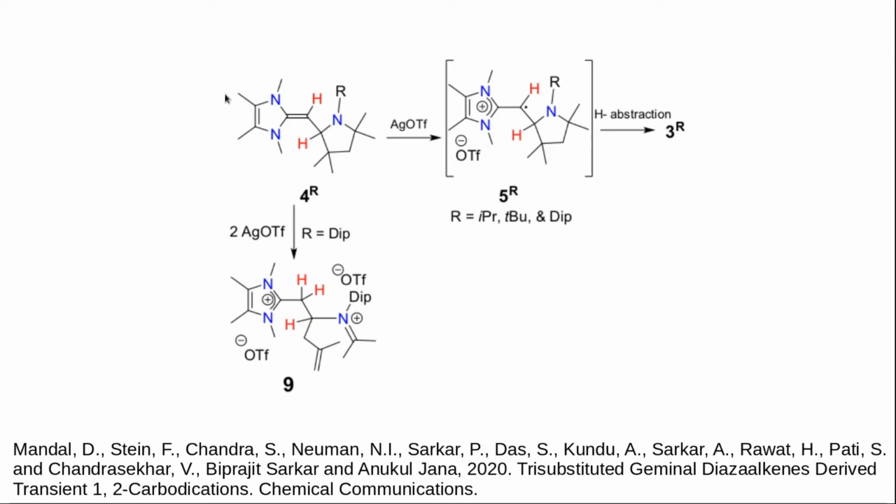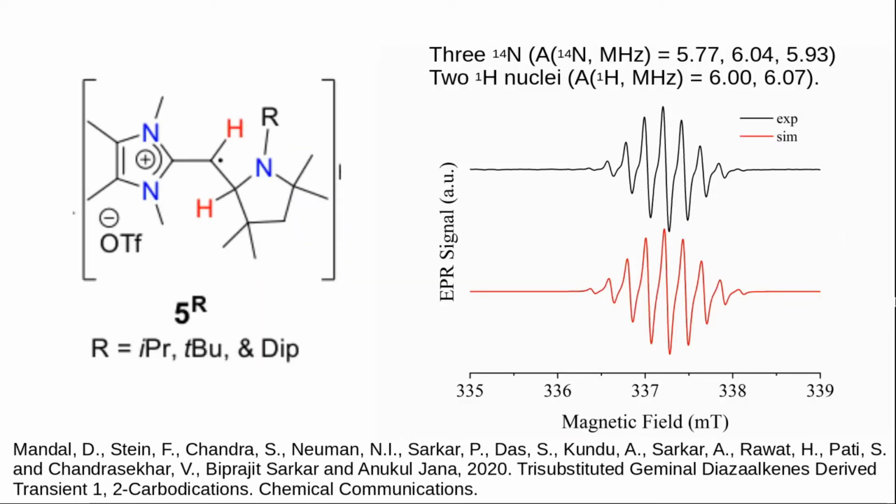this structure for R that when oxidized one time it gave a radical, and after that it produced other diamagnetic products through H abstraction from the solvent or different side reactions. These compounds are quite reactive and quite unstable towards oxygen. So we had chemically oxidized the previous molecule and obtained this radical and obtained this nice EPR signal.